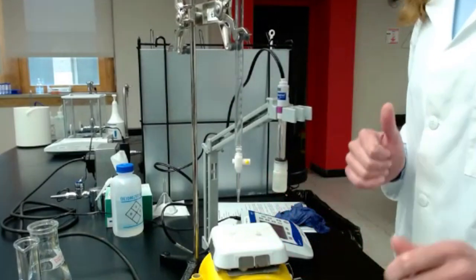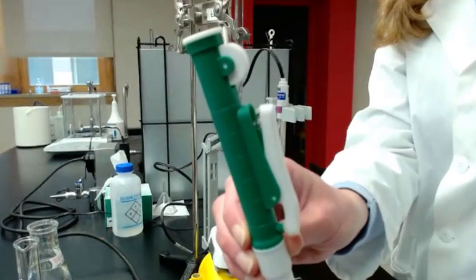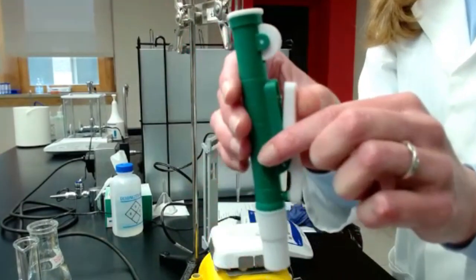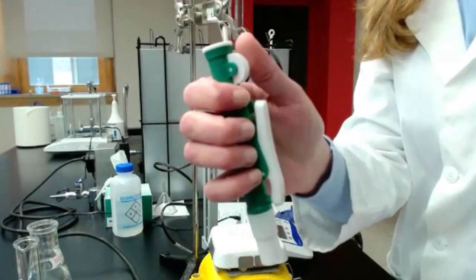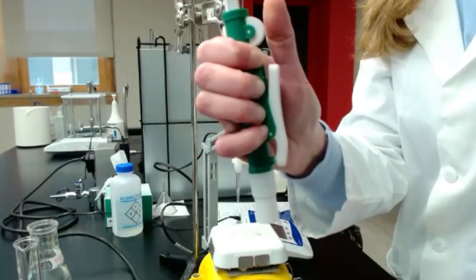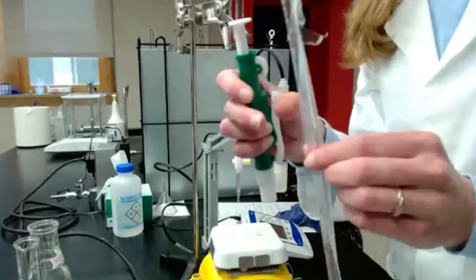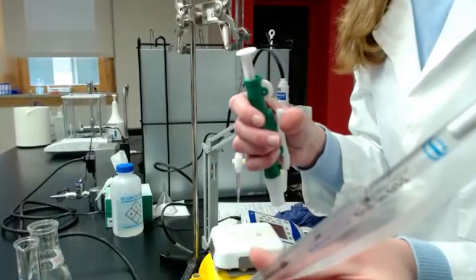You should also have received a pipette pump. So make sure you take that pipette pump. It has different pieces, but there is a wheel that is going to be used to pump the juice. You should also have received a pipette of 5 milliliters.